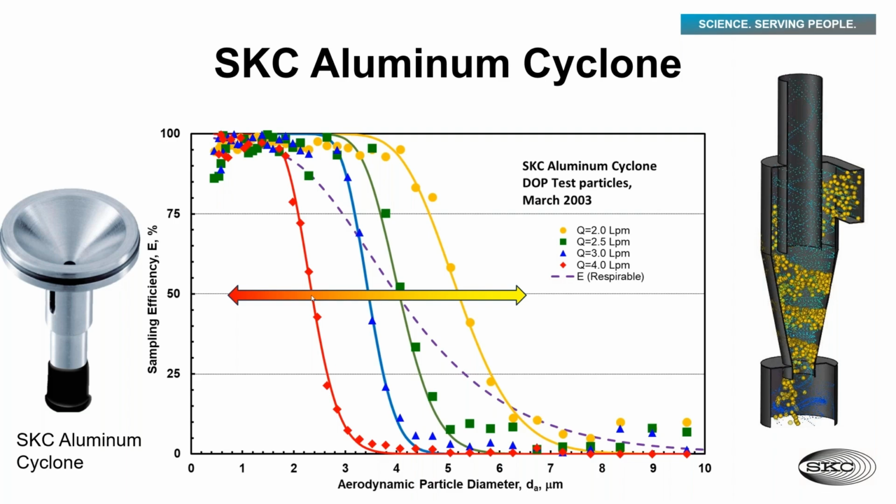So being able to check and recheck what flow rate your sampler is designed for before you sample is a whole lot easier than doing a week's, a month's, a year's worth of sampling at the wrong flow rate, and then figuring out how many of those samples are even remotely valid to help tell the story of what happened.